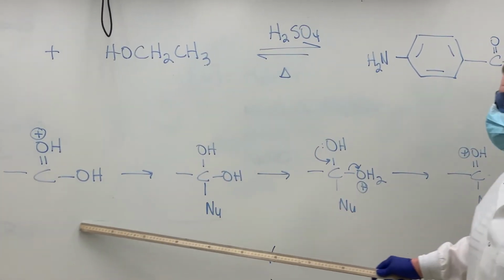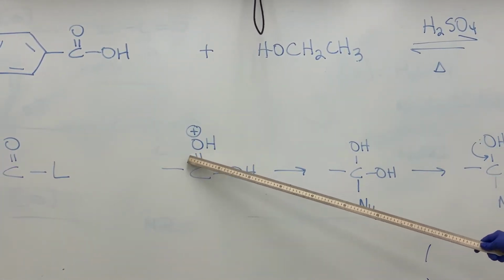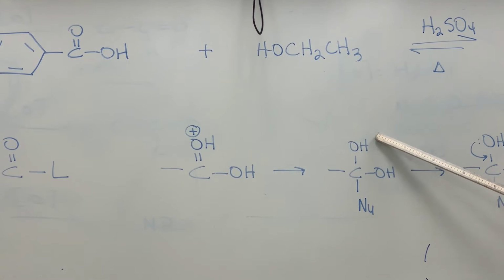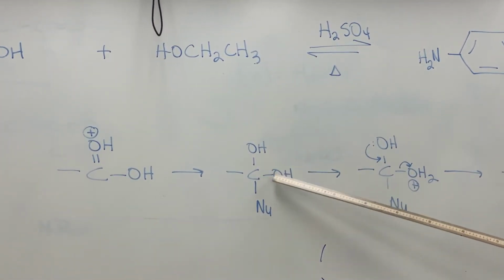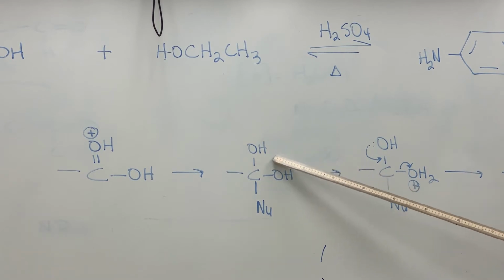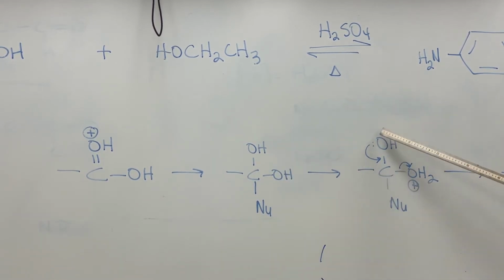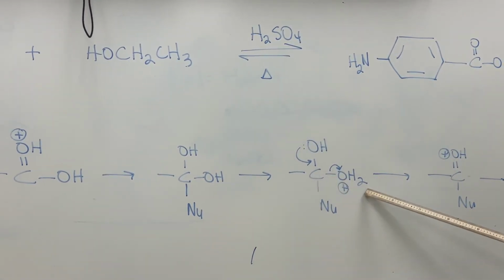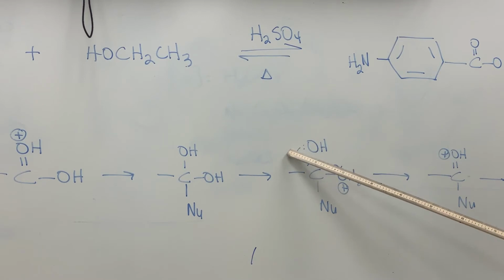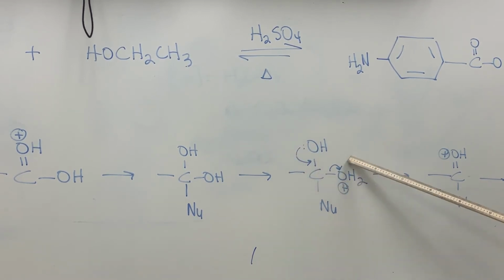So this is where the nucleophile will come in, attack the carbonyl carbon, the pi bond breaks, and the positive charge is removed. We've got acid, and I'm just showing this OH, it could very well have been that one. This can get protonated again, and then notice what happens. If this is protonated, that turns into a good leaving group. Electrons come back in to reform that carbonyl bond, and that kicks off the water.